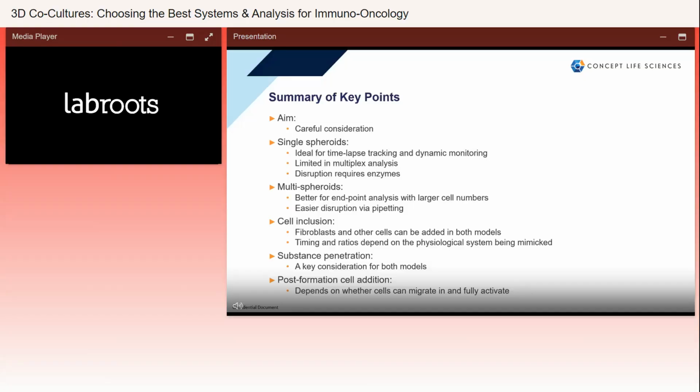And we can see that when we try to do imaging techniques on the single cell system, it's more of a problem, whereas the multicellular system is less of a problem, essentially because it's a much smaller system, but it does mean you can look at, again, different modes of action. And then there's obviously a lot of other things that you could potentially do, and look at how these cells migrate in.